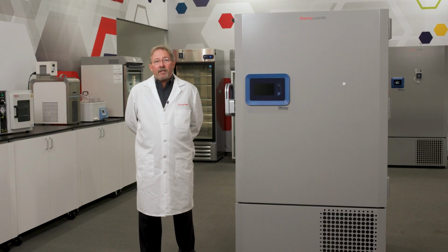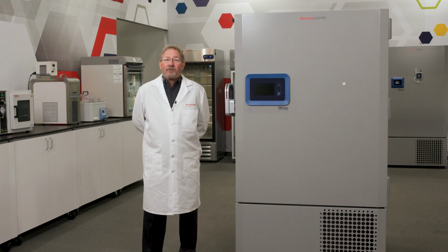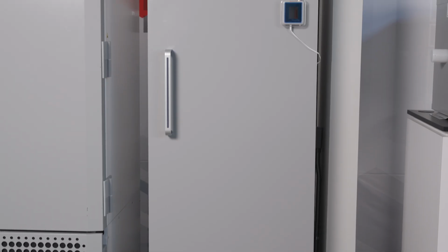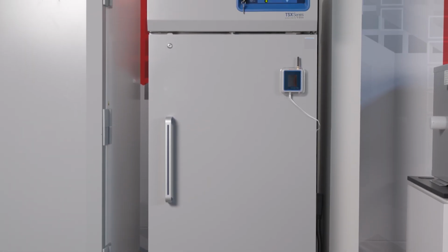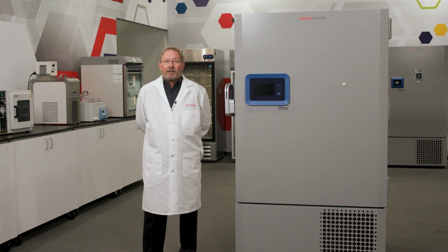The purpose of this video is not to explore the complexities and details of temperature mapping, but rather to talk about the basics of mapping and to address some issues that might affect your mapping results. I'll be sharing a few simple tips that you may be able to use to ensure that the results you acquire through testing truly reflect the temperature condition of the freezer. By following these simple tips, you'll be closer to collecting correct and accurate results with a robust and repeatable protocol.